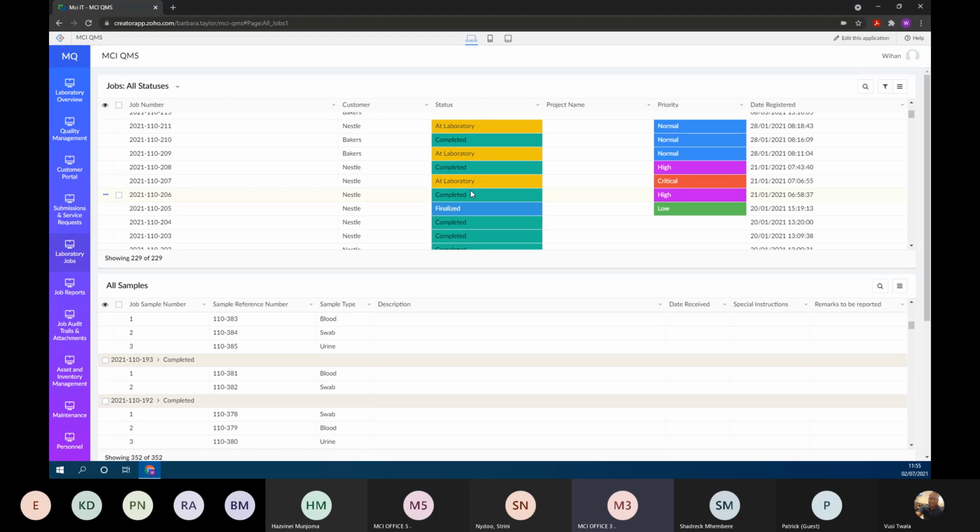So the functions within the system force that onto the lab. For instance, yes, everything is critical, but if everybody sticks to their dashboard and understands what functions they need to perform to keep their dashboard clear, then those individual tests are being managed and are being moved along. Because if it's not moved along, it means that it's stuck on someone's dashboard somewhere. If that answers the question.